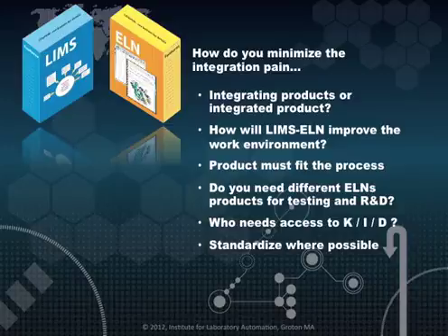You also have to look at how informatics products will improve the operations of the lab's work environment. Products have to fit the process. Changing the process to fit the product can have unfortunate consequences, including concerns over regulatory issues about previously validated methods.